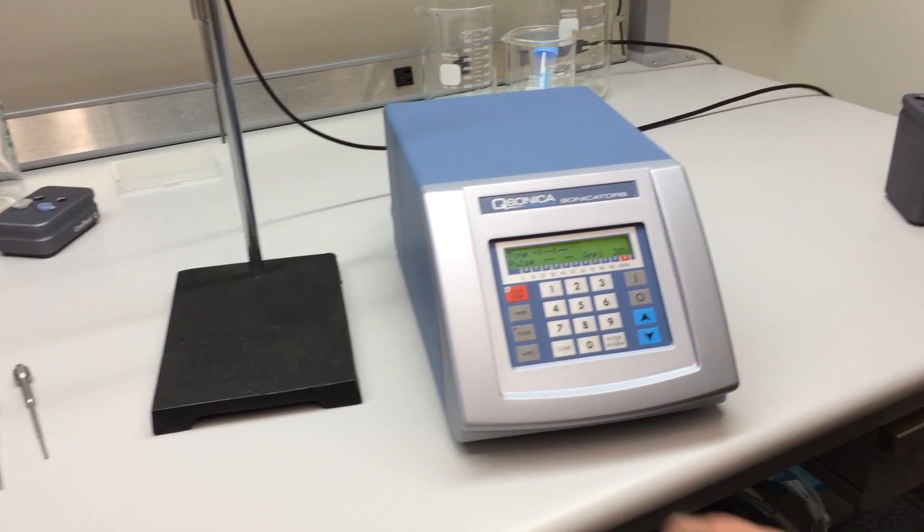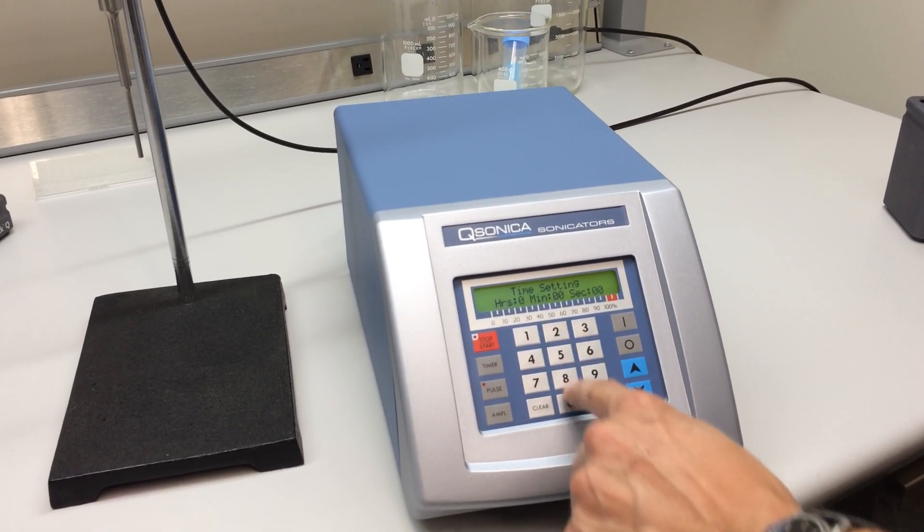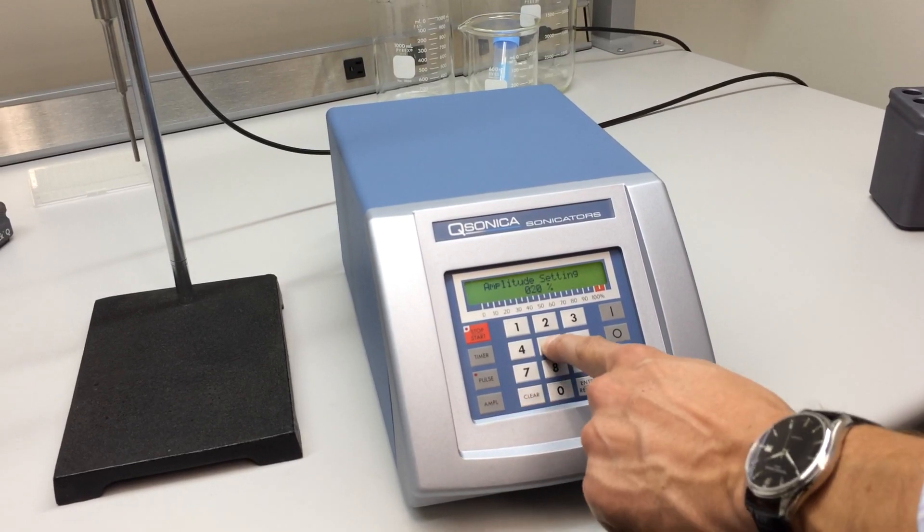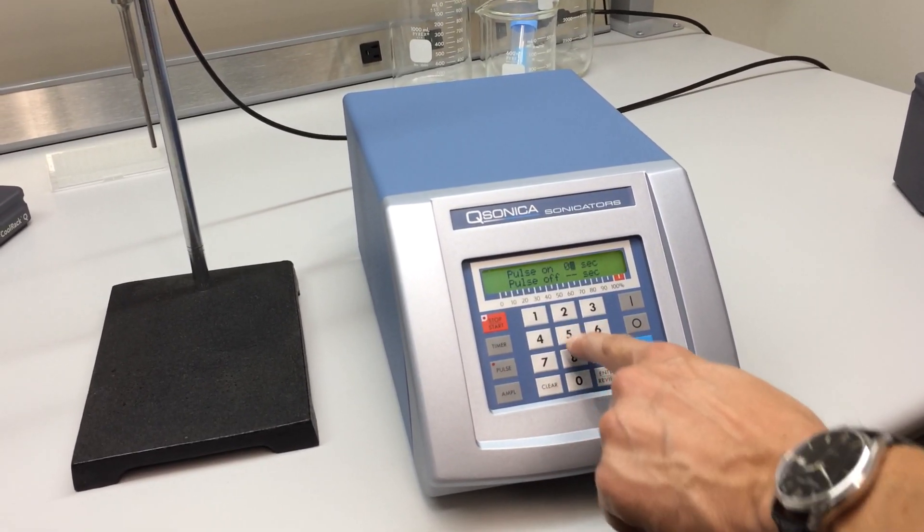For example, we can program the unit for a 2 minute sonication time, set the amplitude or intensity to 50%, and enter a 5 second on, 5 second off pulse mode.